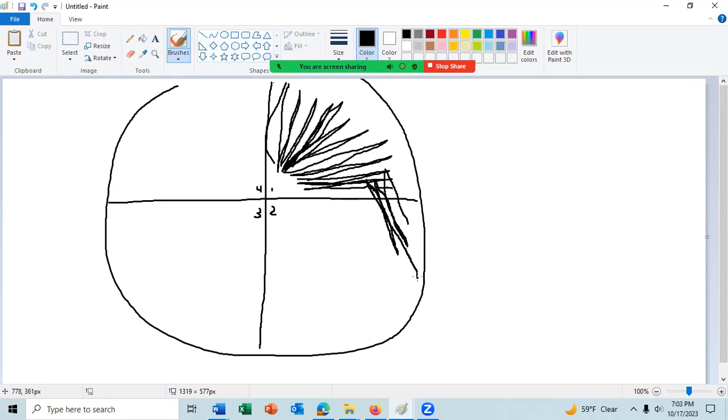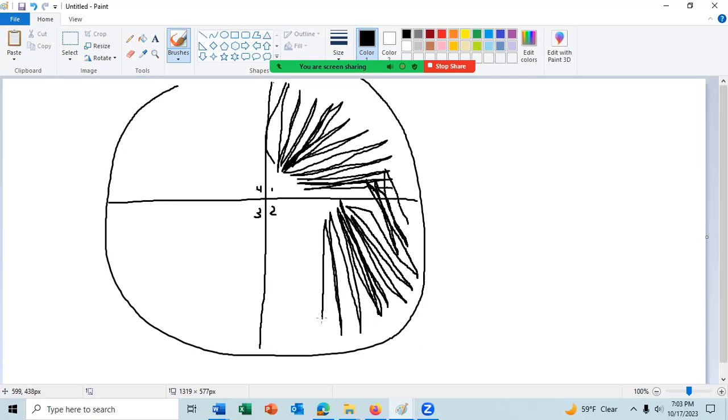And then once again in quadrant 2, you streak it out 20 to 30 times, which I'm not going to do, but you're getting the impression. And like I said, you can go over where you've already streaked. And then you move towards quadrant 3. So in sector 2, this will be the highest concentration of the cells, and this will be the lower concentration of the cells. There will be dilution as you're streaking. It'll be slight, but it will be there.